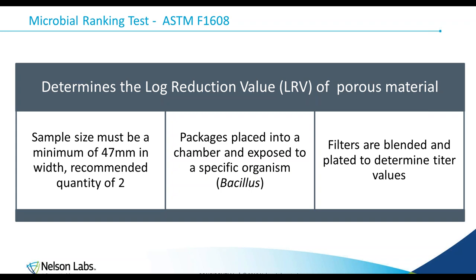The packages are placed into a chamber and exposed to Bacillus atrophaeus, and then they're filtered and evaluated, and the log reduction value is determined for the porous material. This is a test for porous material only. It cannot be done on non-porous materials. And then the values are usually compared between baseline and after shelf life and after distribution.